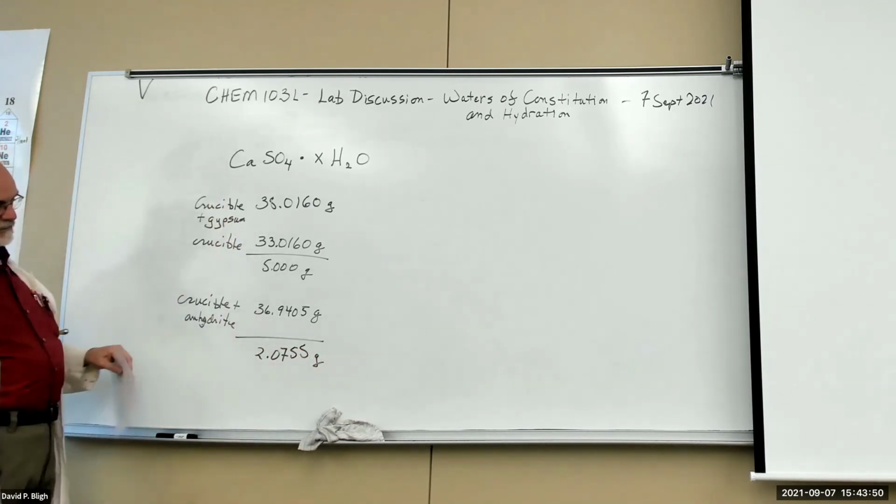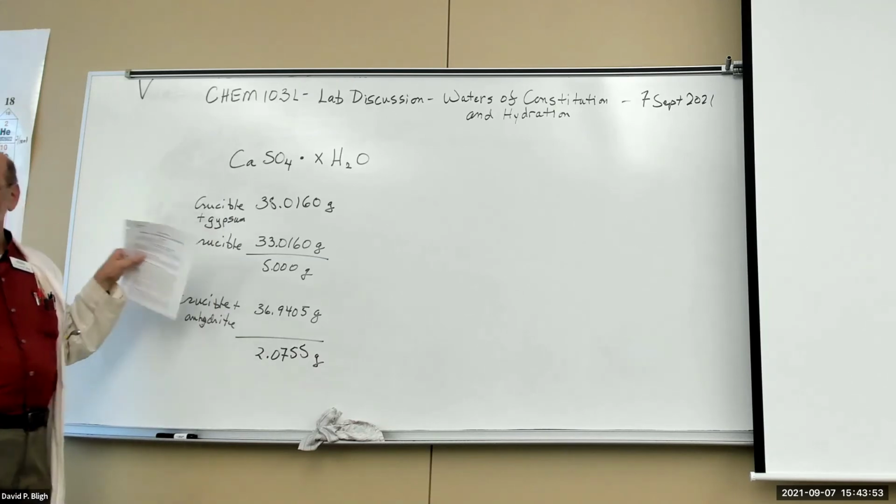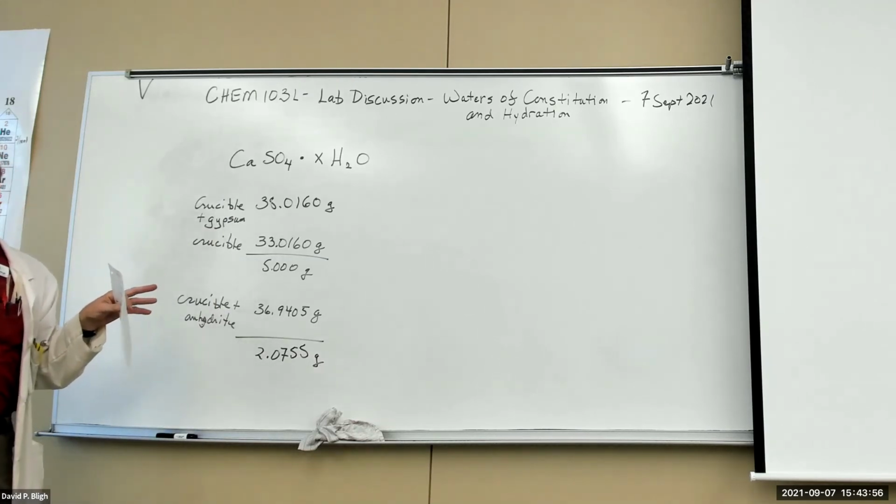So what's the difference? Well, the difference is the amount of water that was lost. Correct?